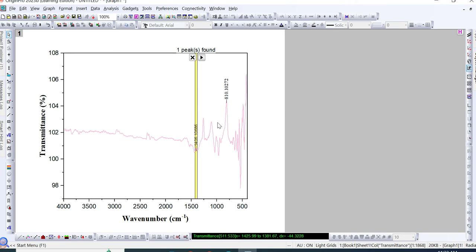And if you want to change its size as well, when you place the cursor and select that line, information appears. If you want to change its size, for example, if I change it to 24, then this line will appear like this, as its size will increase.